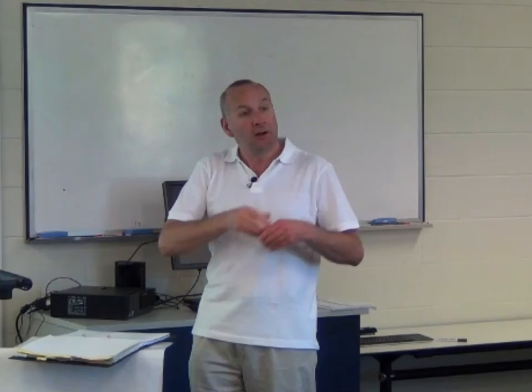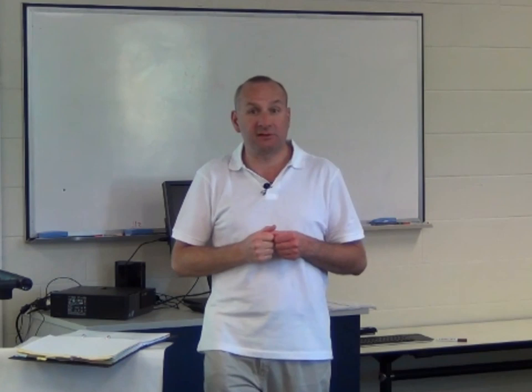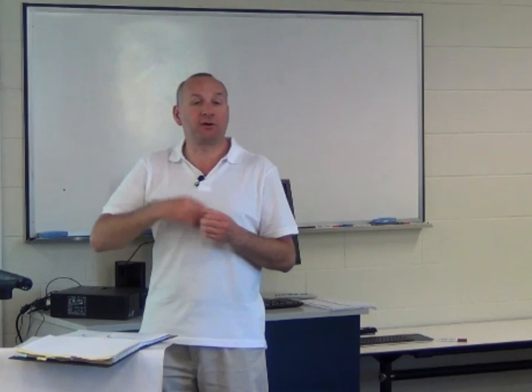We allow it to evolve for T1 on the S spin, and then we transfer it back again. So you could describe this as a double INEPT transfer. So now what we'll do is an analysis of this sequence. We will do it in a clever way.